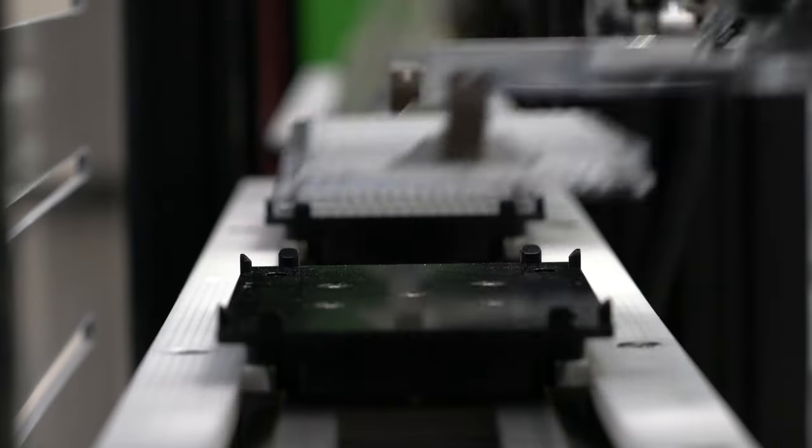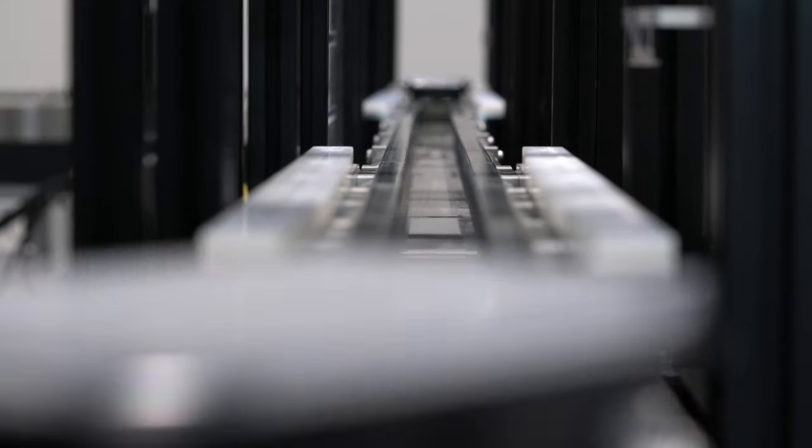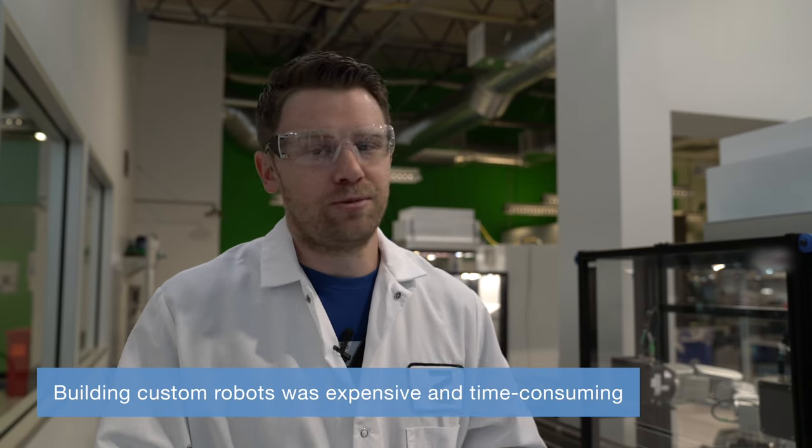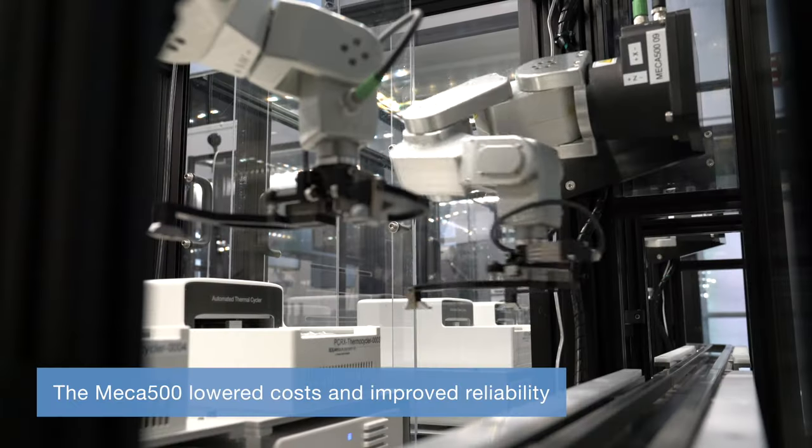We looked at a few other solutions. We decided to try building robots ourselves. We also tried to get contractors to build some robots for us using a very large catalog of parts. We stopped both of those projects because the Mecca 500 was doing so well and it was coming in at a very competitive price for the amount of extra reliability we got for something that was more proven.